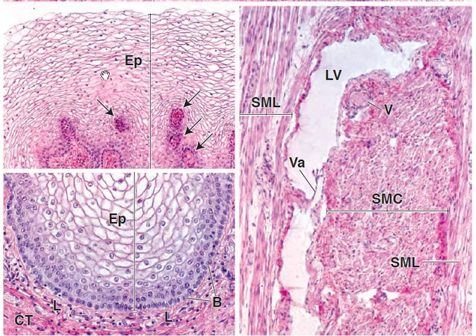So at this point I can ask a practice question. Is the vaginal epithelium keratinized? No, it is not. Okay.